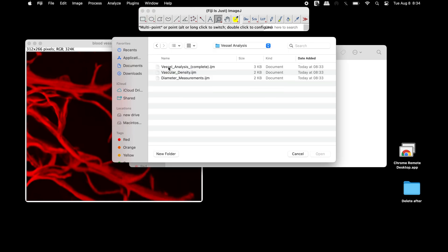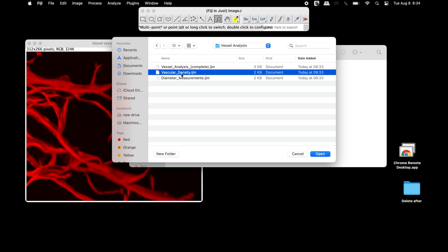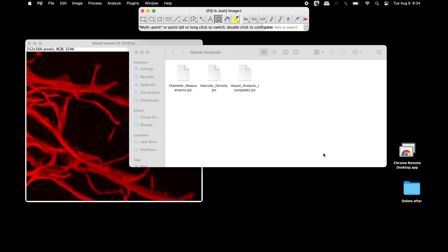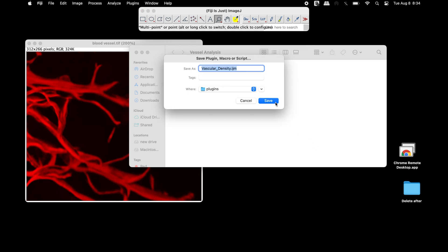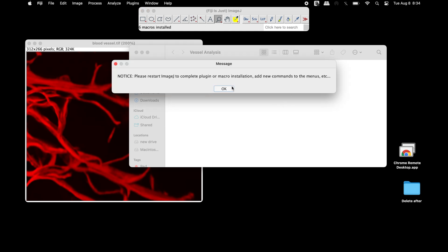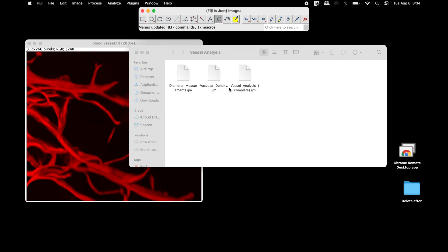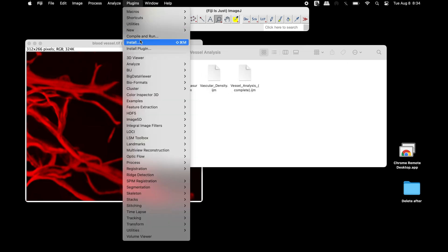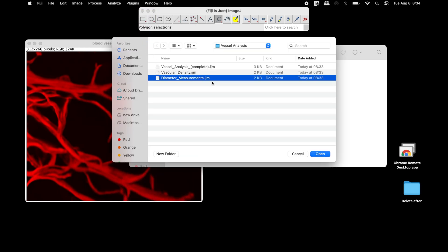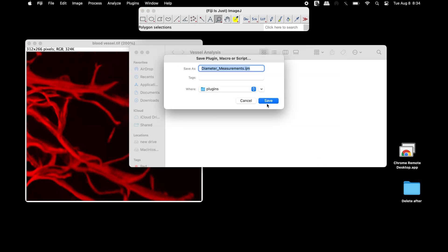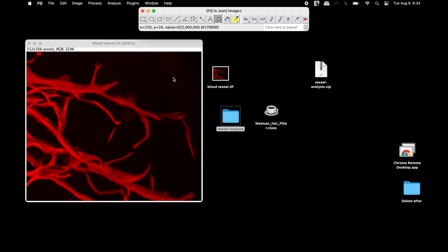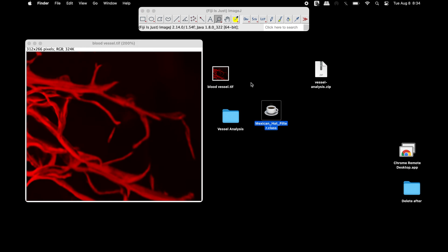To install as individual plugins, click on Plugins > Install, select the vessel analysis folder, and select the vascular density plugin, then click Open. Save this plugin in the plugins folder. Users may restart Fiji at this time if required. Proceed with installation of the diameter measurement plugin, then install the Mexican hat filter plugin.